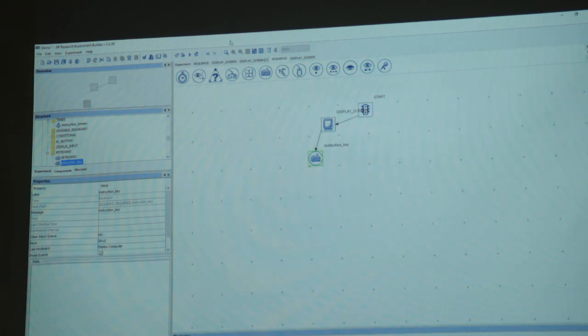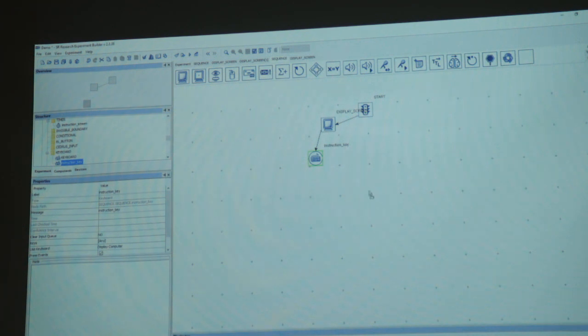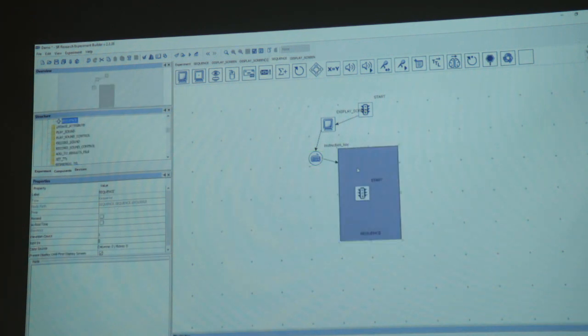So okay, now once we have this, we will start actually building the task. Okay, so you create another layer, and this layering is important. You might think it seems very unnecessary and too much of a hassle. This layering is important so that your program doesn't confuse task A with task B. You have to basically keep it clean, so your code is very clean in the background. You're not writing code here, but as you are dragging things, the code is being written in the background in the software. You don't want that to be very messy, which is why you create these layers.